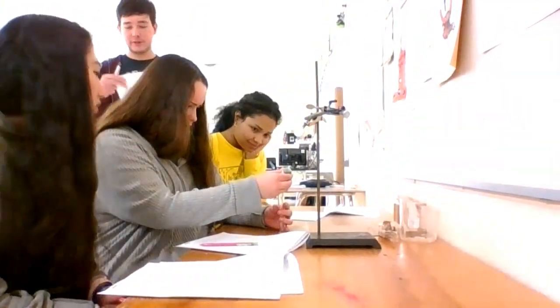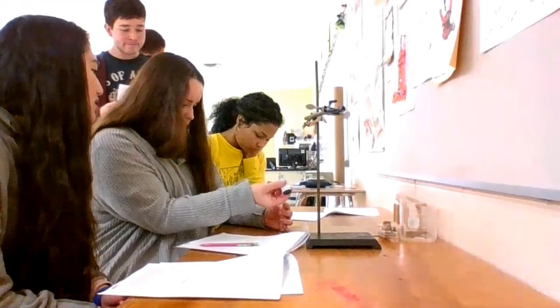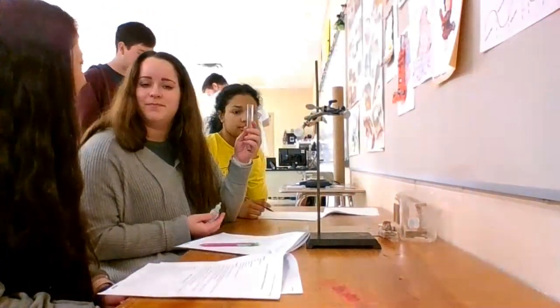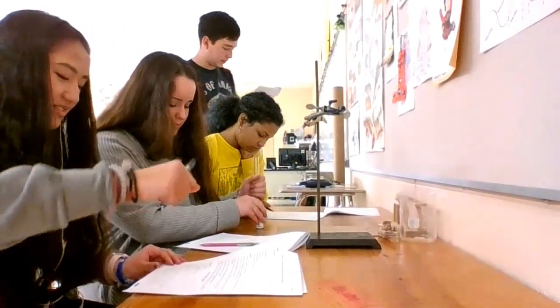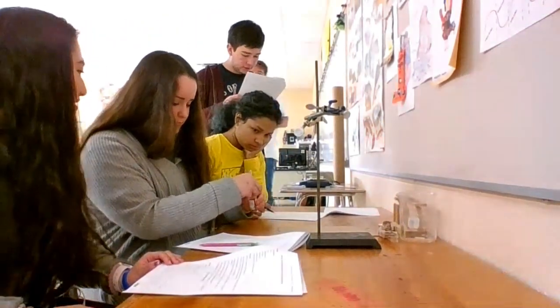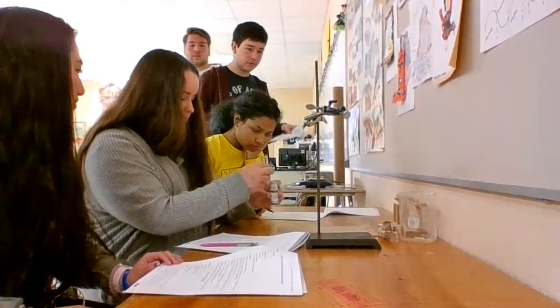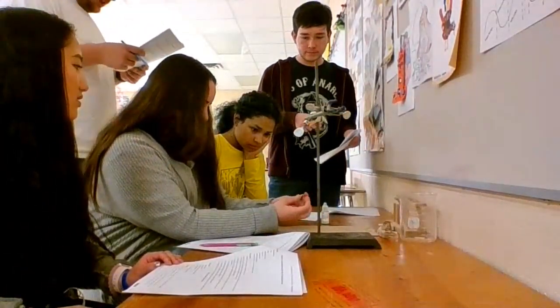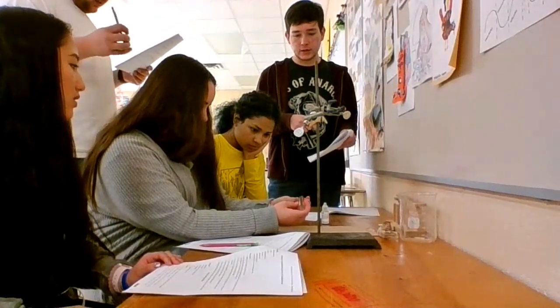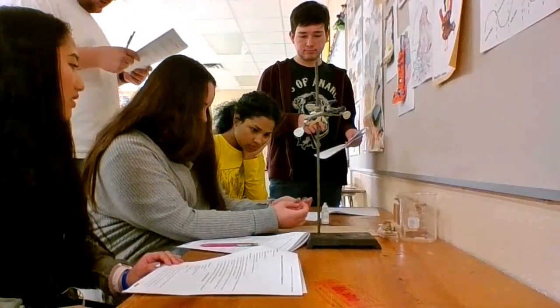Tilt and rotate. Start with a dry test tube and then straight cut. And here's your mortar and pestle. There you go, Sarah, you do.